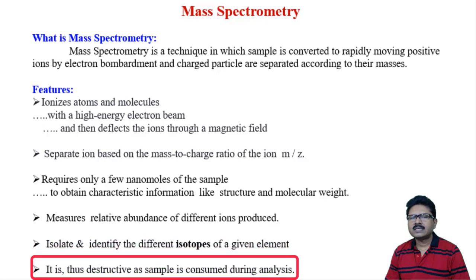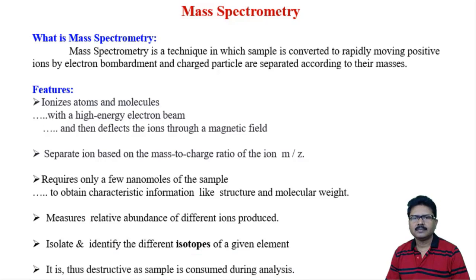As in this case all the samples are ionized, we can say it is destructive in nature, as whatever sample we use, all of it is ionized. So if we want to get back the sample, that is not possible.